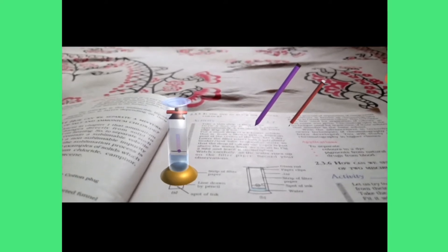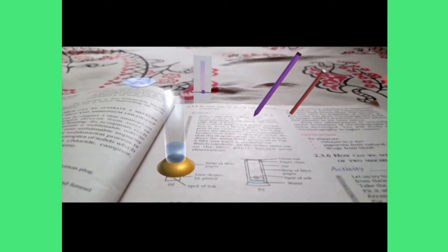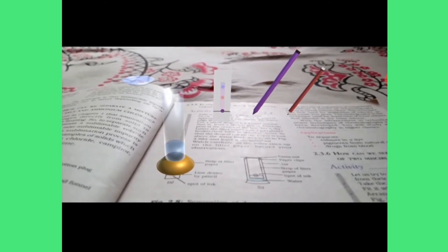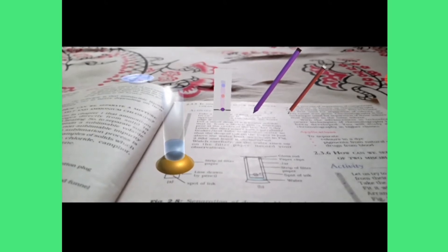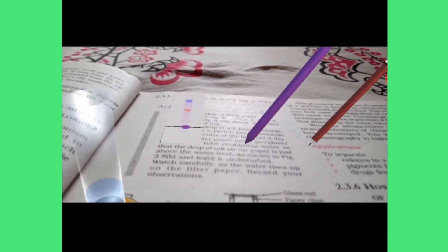The paper is dipped into the jar of water. The water runs throughout the paper and the ink also runs along with it. The paper is then taken out and dried. When the paper dries up, different colors present in the ink become visible — the inks get separated and are clearly visible at different positions.